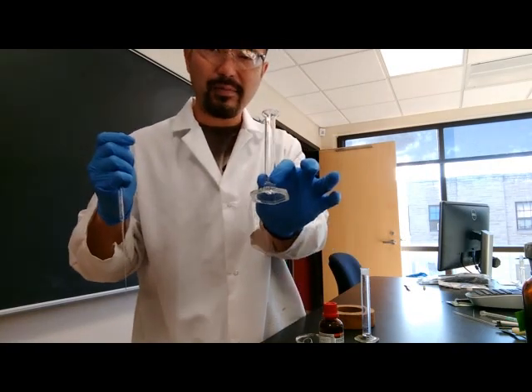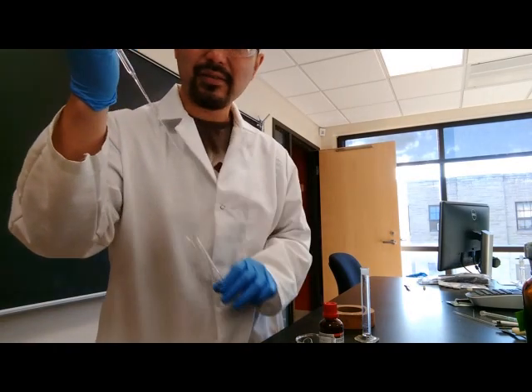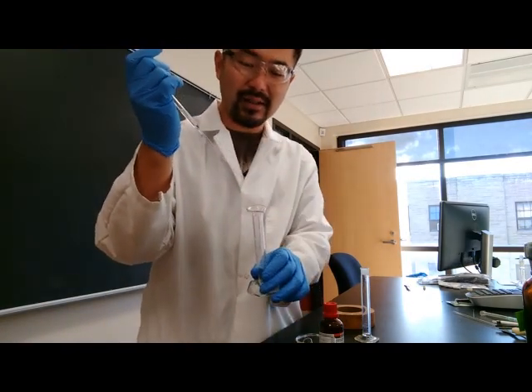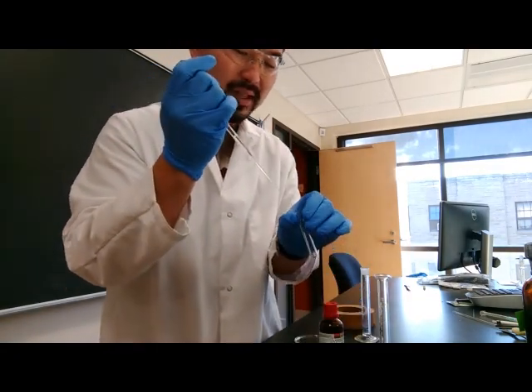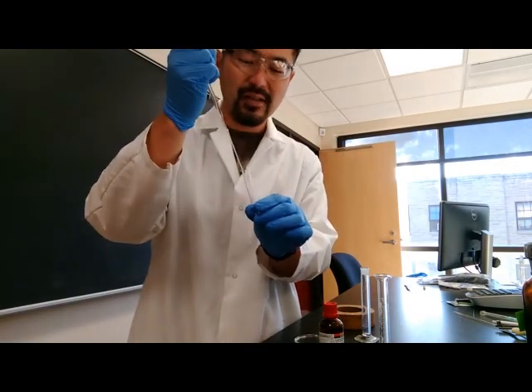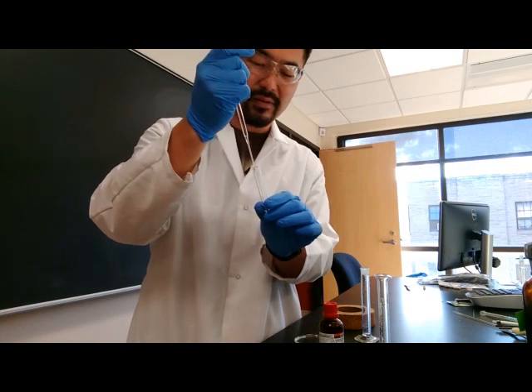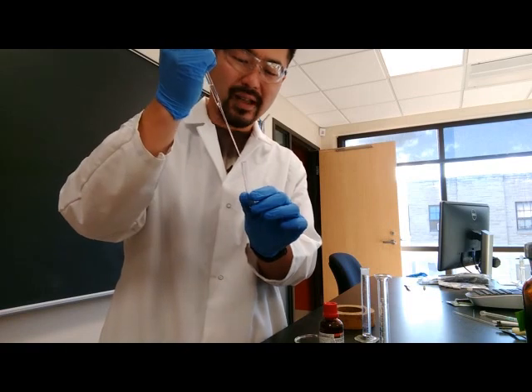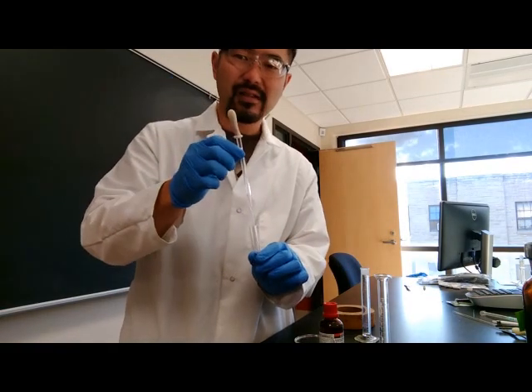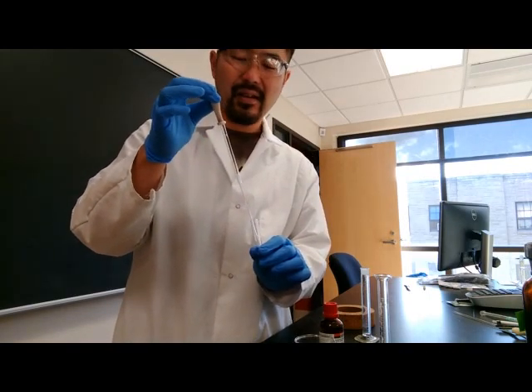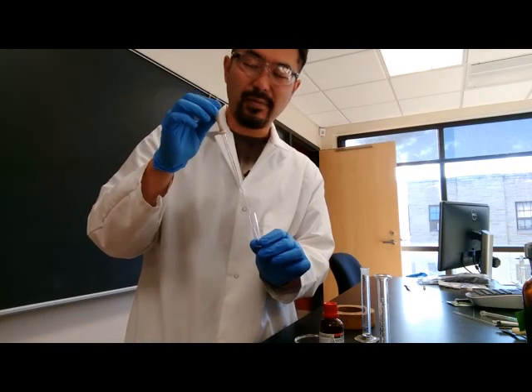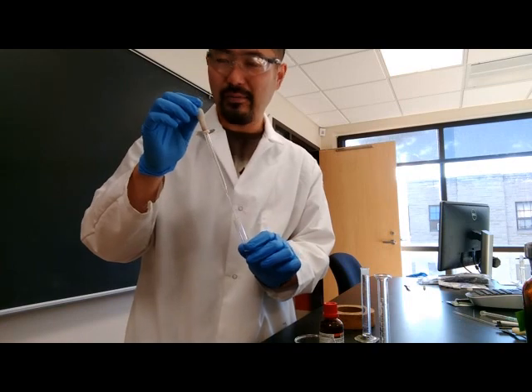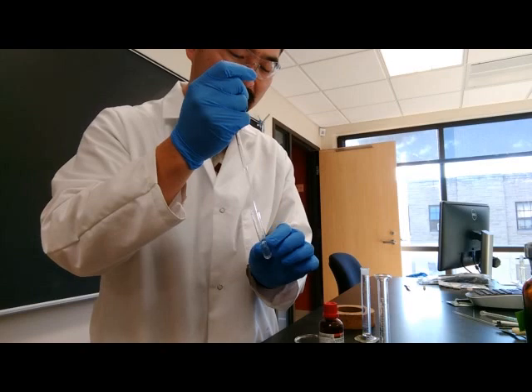You will want to just copy where the line is from another Pasteur pipette. That way you can have a brand new clean Pasteur pipette that has not touched anything whatsoever that will hold one milliliter. And so let's right now pretend that this is the deuterated solvent. And if I take it up to the line, this is approximately one milliliter. And what I'm going to do is dissolve the sample. Let's just pretend there was a sample in this test tube. Dissolve the sample with the deuterated chloroform solvent. And what you can do is you can carefully pipette this up and down. And again, every time you're using a Pasteur pipette, always be careful about not letting anything get into the pipette bulb. That's the worst thing you could do using a Pasteur pipette. It would be a very horrible source of contamination and other issues. So carefully pipette this up and down.